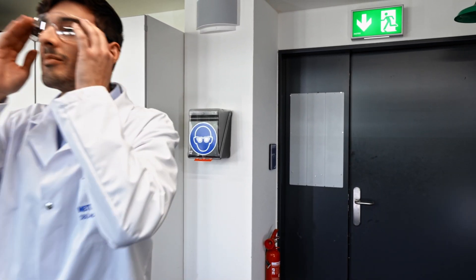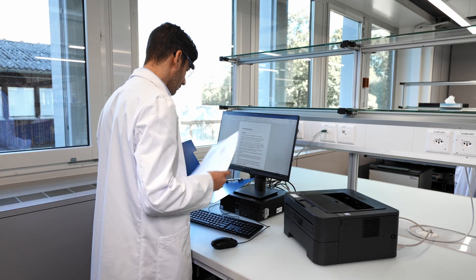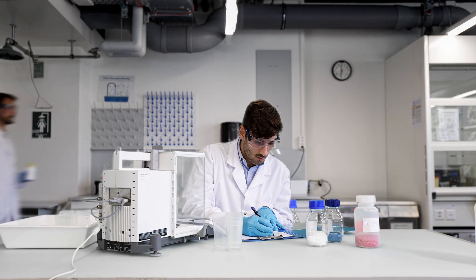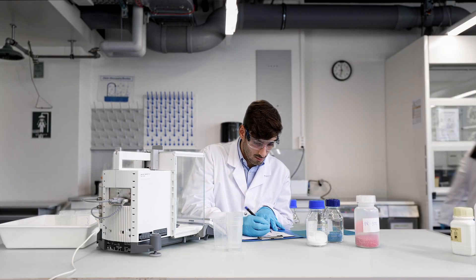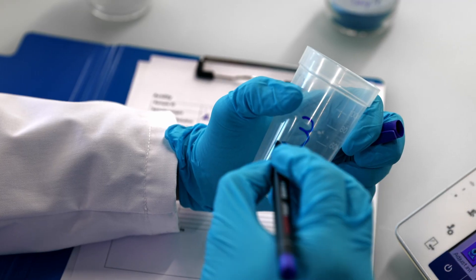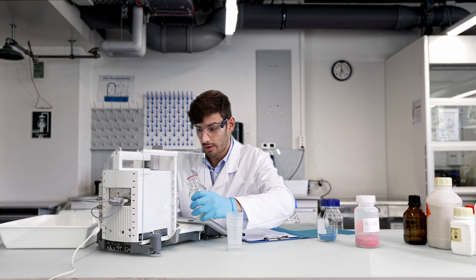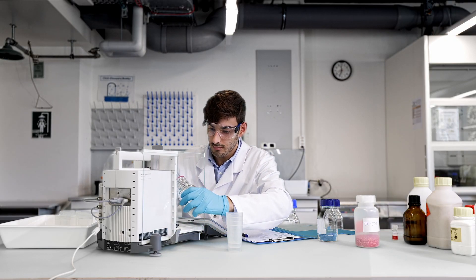Setting up for a day's work in the laboratory can sometimes get away from you. Do you sometimes feel like you just can't get ahead with the sample preparation, instrument setup, and results documentation? Wouldn't it be better if things could just be smarter?